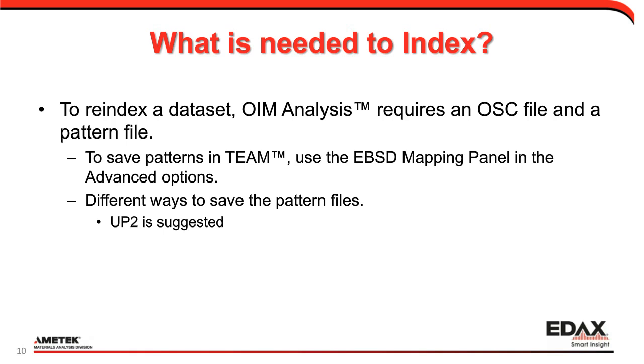We have to have the patterns to reindex, because we're going all the way back, redoing the Hough transform, and then going through our indexing routine. So I need the patterns. Without the patterns, I can't reindex.